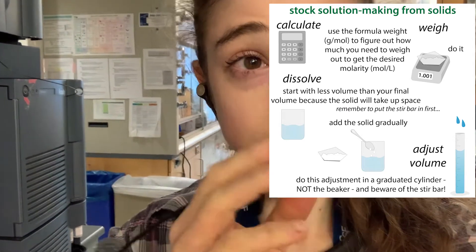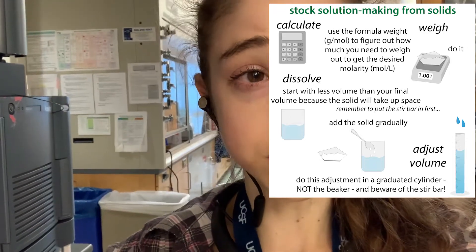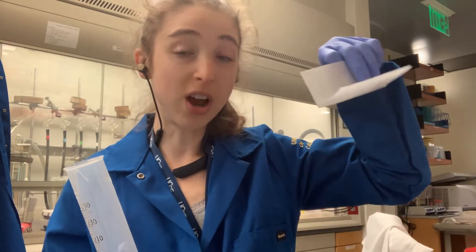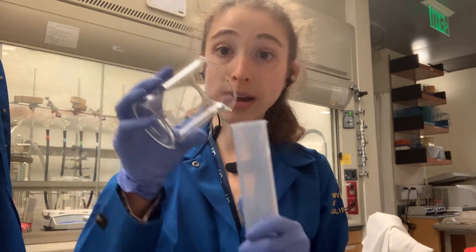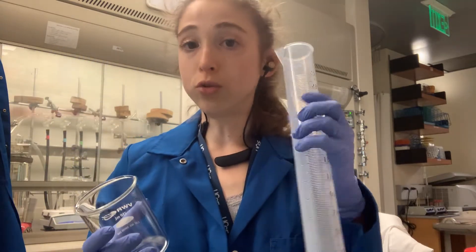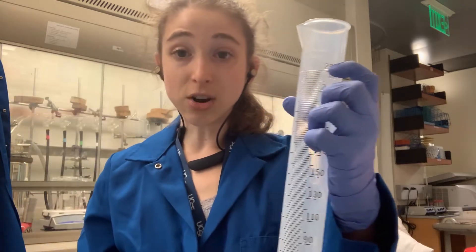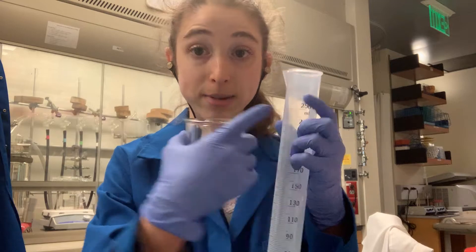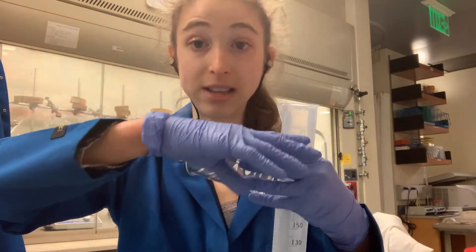Also remember that the lines on the beakers are only approximate — don't trust them. If you go through that line, you might actually be above your target. So be careful with that. You also want to allow room for rinsing any of the extra stuff off — whether it's your taco we talked about before, or after you pour from a beaker into your graduated cylinder. Remember these lines on the beaker are approximate; the graduated cylinder is what you actually measure with. And remember to read from the bottom of the meniscus — look for the smile and go to the bottom of the line. That's where the measuring level is.